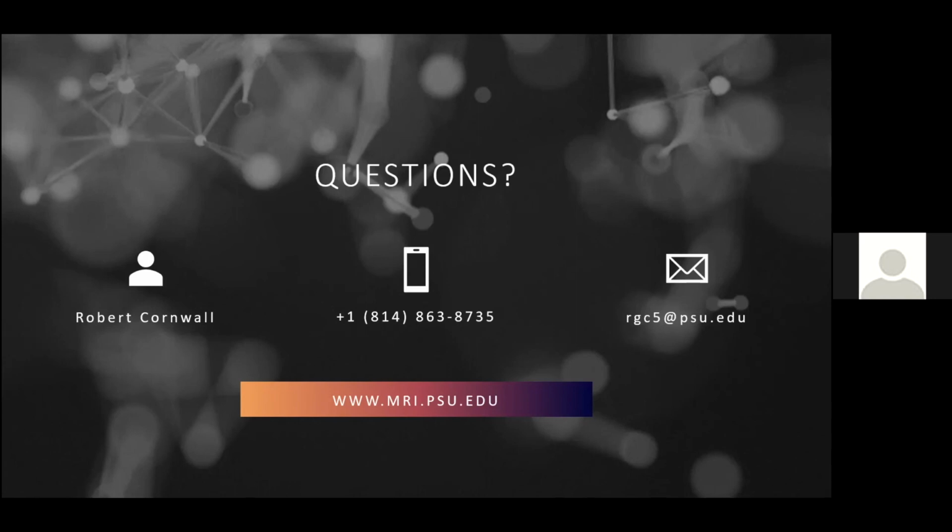tool for another user. So if it's a staff member and a new user, the staff member would sign in, but they would select use tool for another user, select the name of the user they're working with, and that would then charge the tool use to the user. And if it's a staff member, it would charge staff time for the staff member's time as well. Right. If it's just another user in the group, then whoever is logged in is who's going to get charged. That's true. If it's just 2 users, training staff members. Yeah.